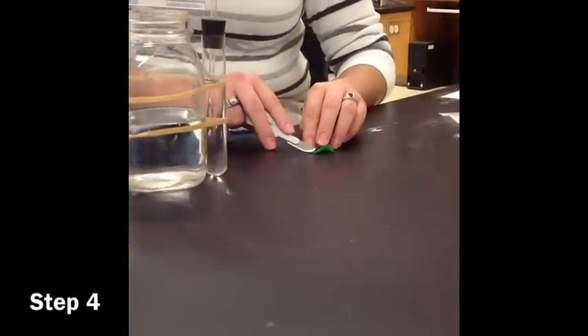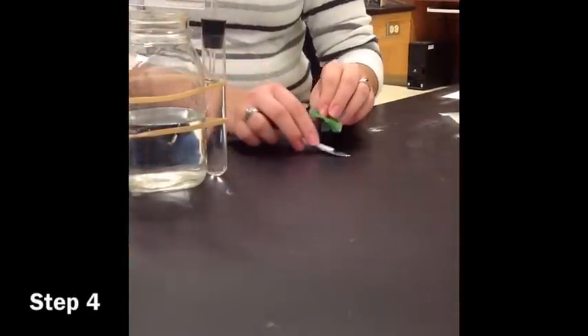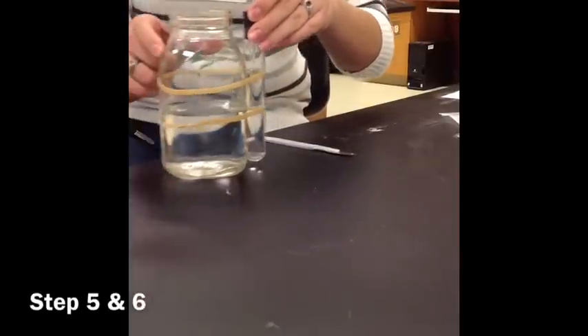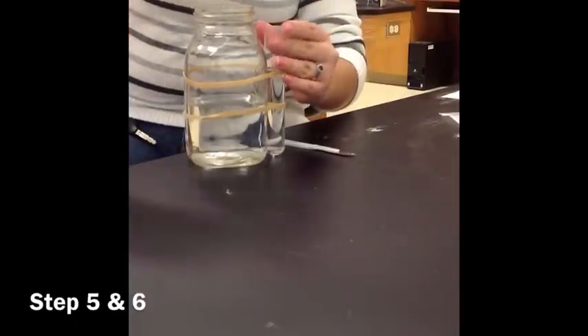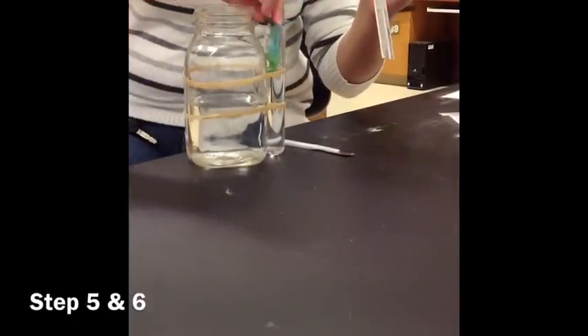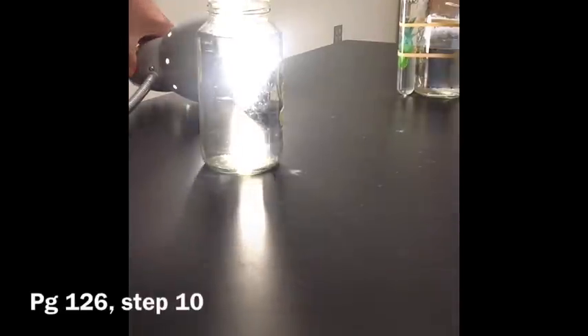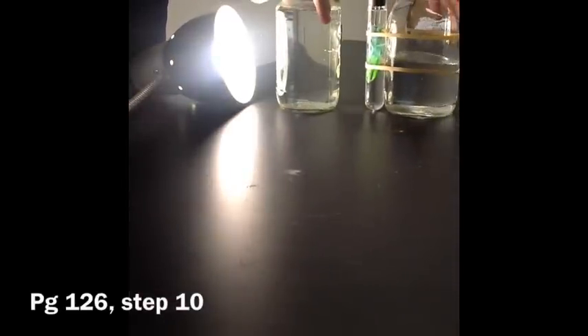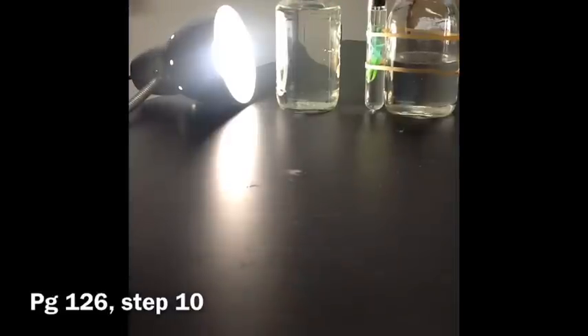With the scalpel, trim the stalk end of your elodea sprig or any other broad-leafed water plant so that the stem is cleanly cut. Submerge the plant cut end up in the baking soda solution that's in the test tube. Place your lamp fitted with a 100 watt bulb in line with your jar filled with tap water and your plant inside the respirometer. This is the basic set up for part 1 of the exercise.